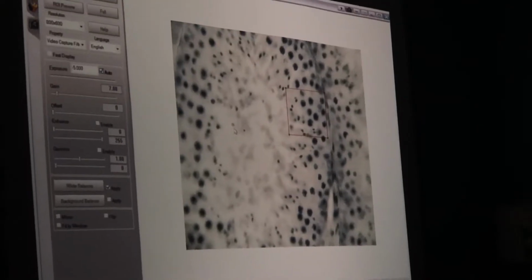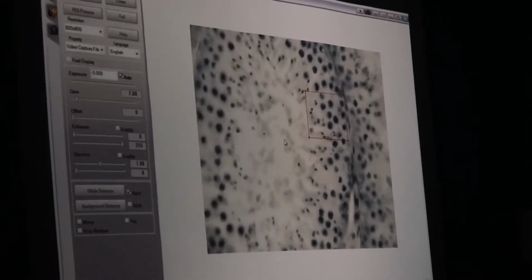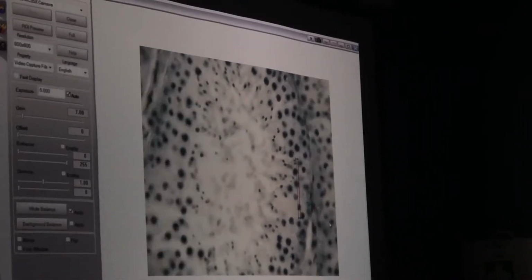So out here we might expect to see spermatogonia, primary spermatocytes, secondary spermatocytes, and then by the time we get in here, oftentimes when you look at the middle, you'll find some with tails. These are going to be what? Yeah, probably spermatozoa if they have tails, right? Okay, so they're undergoing spermiogenesis there, all right?